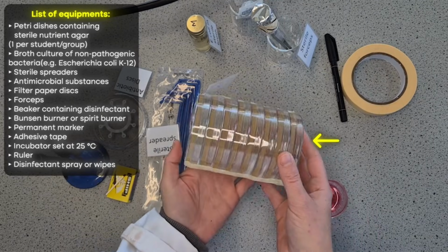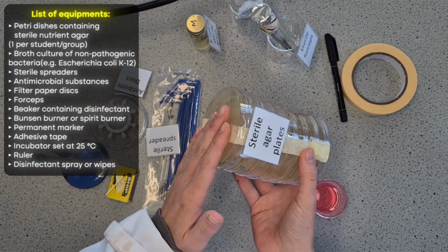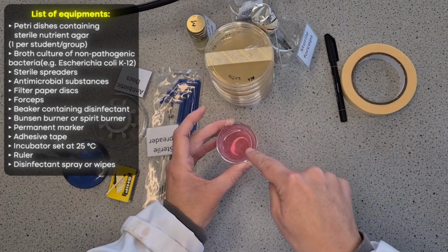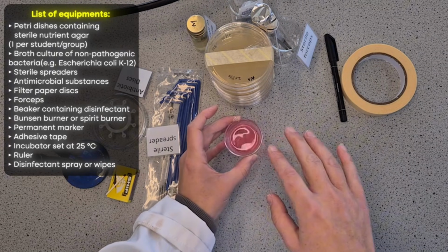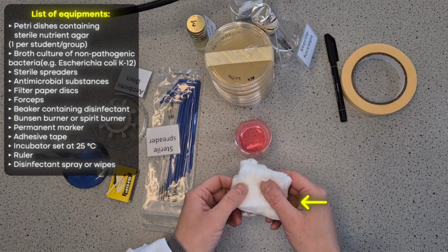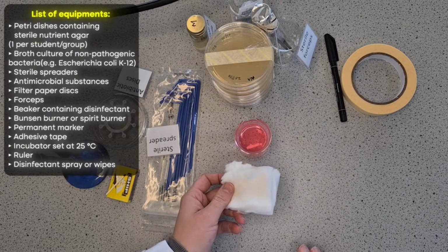I've got pre-poured agar plates, which are all sterile. So we've got sterile agar plates pre-made. And then I have my Virkon disinfectant, which I'm going to be using for the equipment after it's touched the bacteria. And I'll also use this to sterilize the table at the start and the end. And then finally, I've got some cotton wool to use to dip into my disinfectant to clean down the surface at the start and the end.